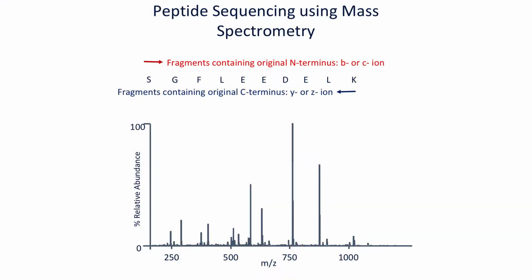What mass spectrometrists like to use to digest their protein mixture is trypsin, because it generates an arginine or a lysine at the C-terminus. And then you can very easily see that these can be protonated, so you have a chance to actually see these fragment ions. If you look at HLA peptides, nature has digested for us, so we no longer can direct what we want to have at the C-terminus.